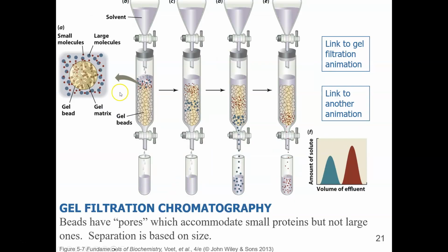And that's shown in this picture right here, where we can see our gel matrix, and we can see that the blue proteins can't get into the pores, but the red proteins can. So the blue proteins come off first, and the red proteins come off next.